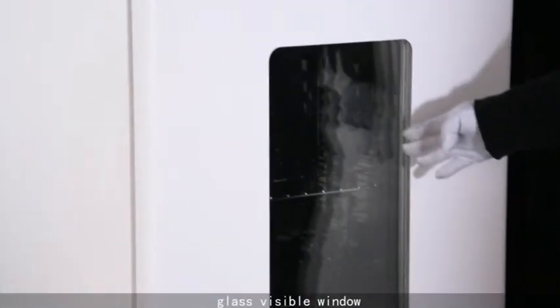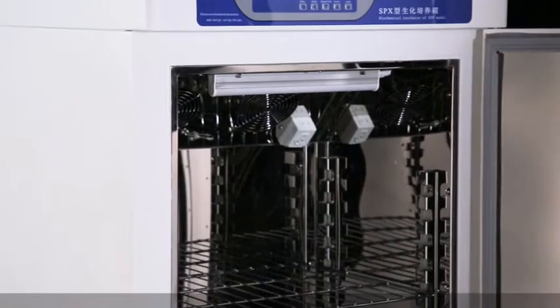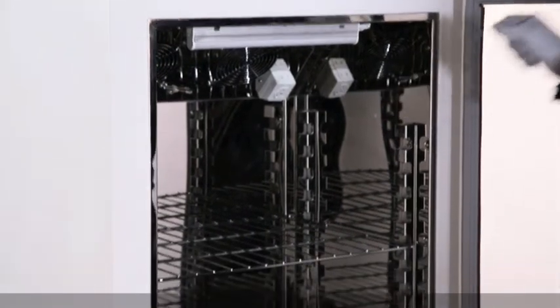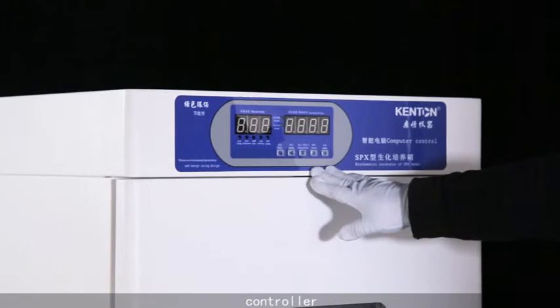Glass visible window, internal power outlets, controller.